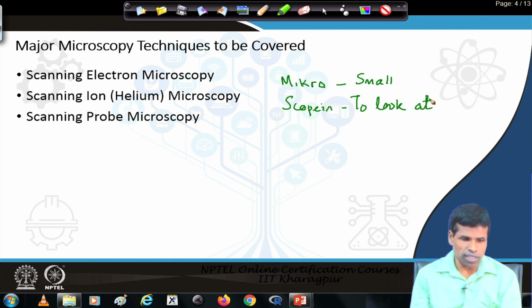Then the first word is scanning. Scanning means running down or systematically moving a probe, which can be a focused ion beam or focused electron beam, on the surface of an object to produce an image. So, therefore, we say scanning.